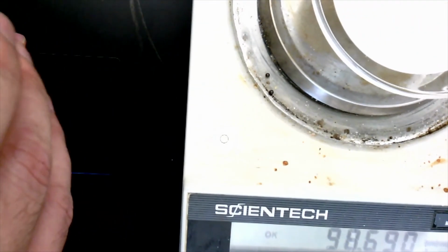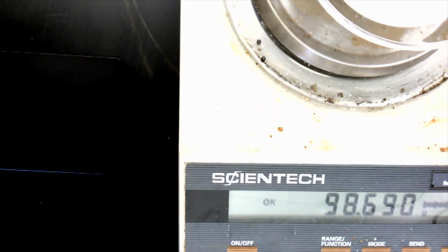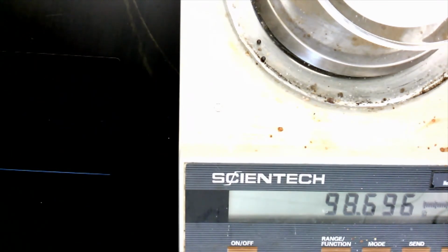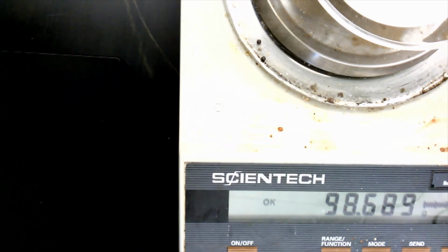So my last step is just to weigh this. This is for procedure A, don't forget. For procedure A, weighing the magnesium chloride product, the evaporating dish, and the watch glass. The measured mass of magnesium chloride, watch glass, and evaporating dish is 98.6.